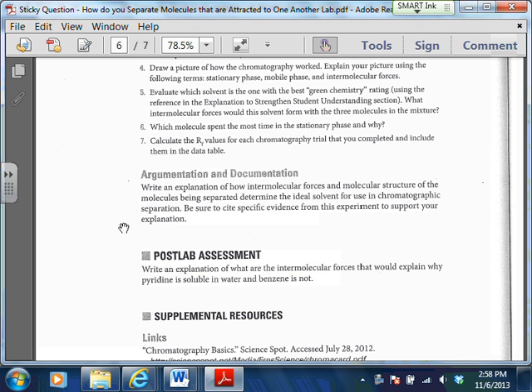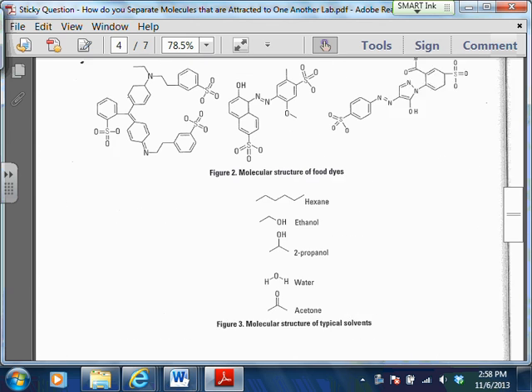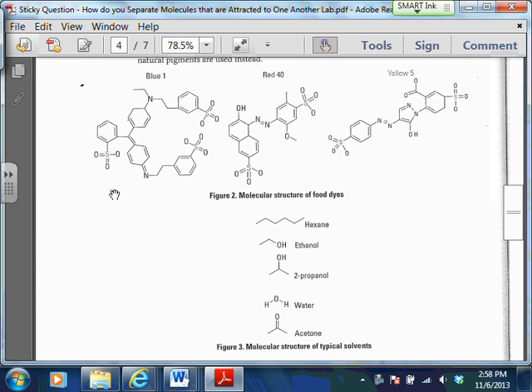Okay. And again, the question is why? Can we answer that based on what we talked about before, about the polarity of all of the three molecules? Yeah, it was basically the least polar out of all of those overall. And for the reasons we talked about, probably the major one is that it's basically the smallest out of the molecules.